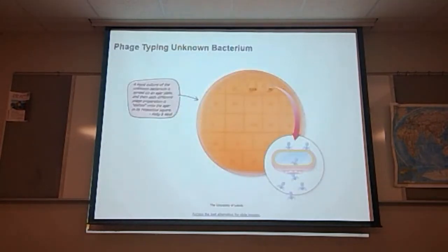Here's an example of the plate. Notice the little blocks that are set up. You've got a growth medium here. The entire lawn of this plate will be covered with the bacterial growth, and then the different phage types. Like this would be phage 79, and this would be phage 52A. This is phage 52. That looks like 29 right there. There's 3A, et cetera, et cetera.